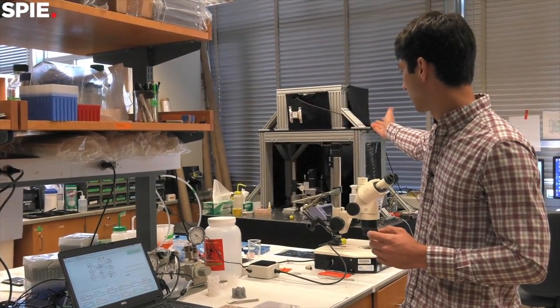So, this machine behind us is a projection stereolithography printer which allows us to print at single micron resolution and we're using it right now to create perfused scaffolds that we can use to grow thick tissues up to a millimeter in thickness which is about 10 times the current limit of basic tissue engineering.